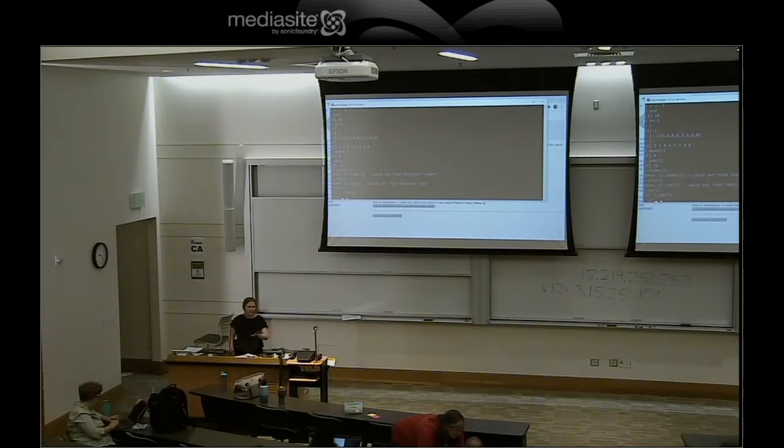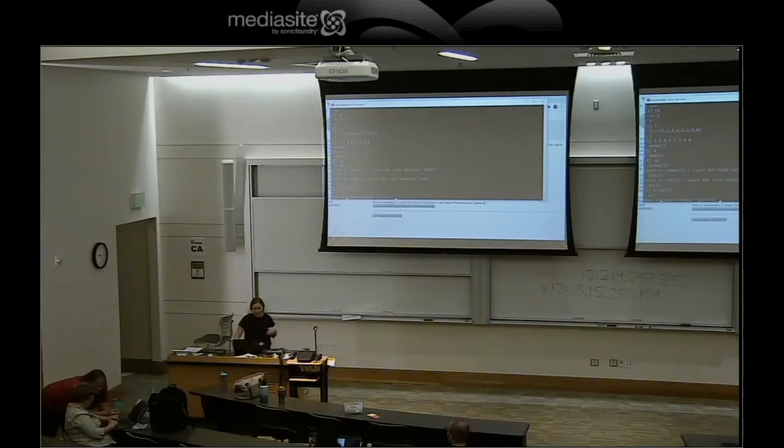Like I said, this isn't the most beautiful way to use R by any stretch, but it is the actual base R functionality, and this may be what you have to do on a supercomputer if you do not have a Viz node, like what you do on your actual laptop. And like Mary said before class, counts tables overall are really not that big compared to your giant BAM files. So you can pull your counts tables or your differential expression results, which we're going to go over in the next 2 days, onto your local computer and then work with them in the RStudio that you installed today.